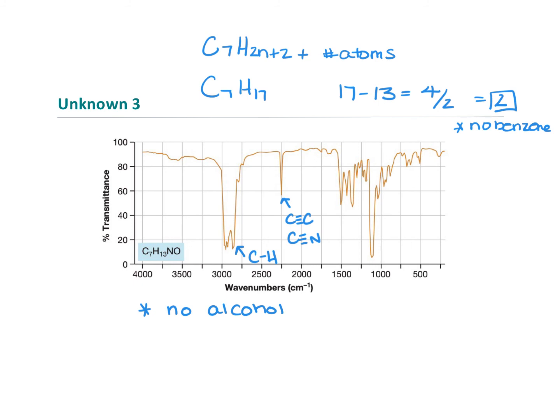So we need to go and look at about 3,300. So I'm over here at right around 3,300, and I'm not seeing any sort of alkyne CH stretch.